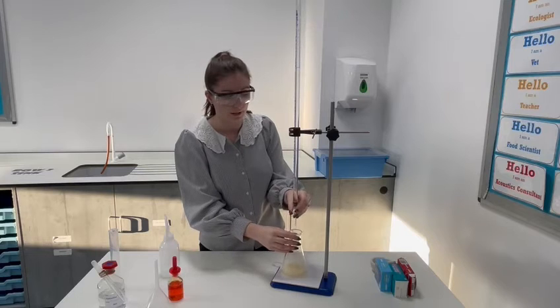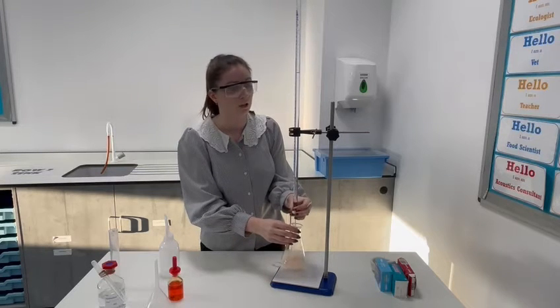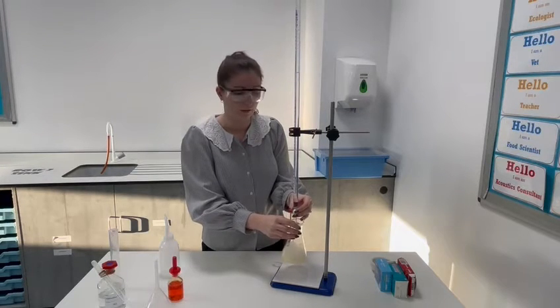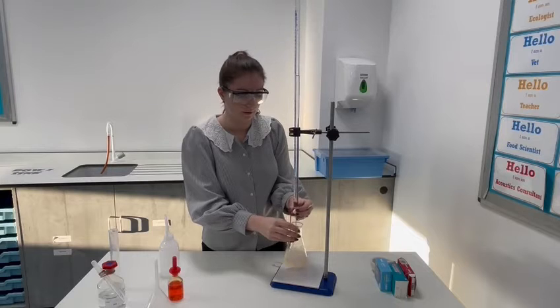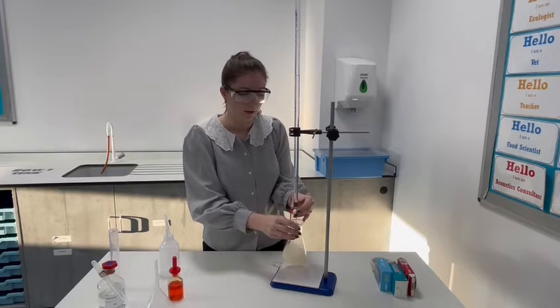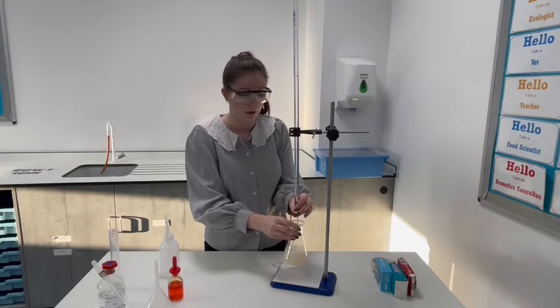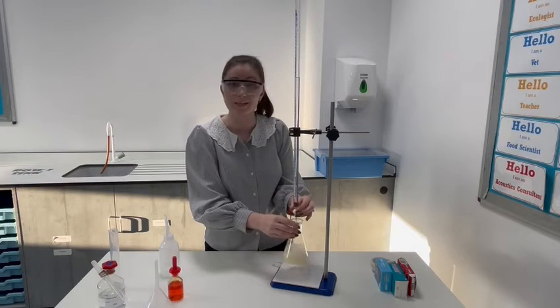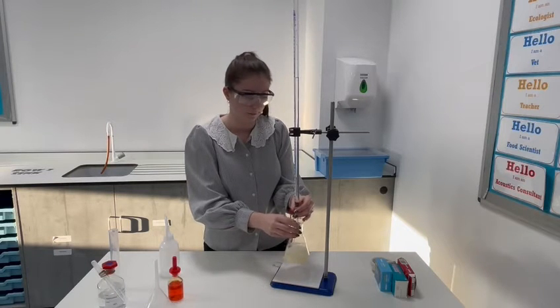And we're going to start adding the acid just as we would a titration. At first we can do that 1 or 2 centimetres cubed at a time. Make sure we swirl that flask. And we can see already my indicator beginning to change colour, and we want to keep going until our indicator changes colour and stays that way for a minute.